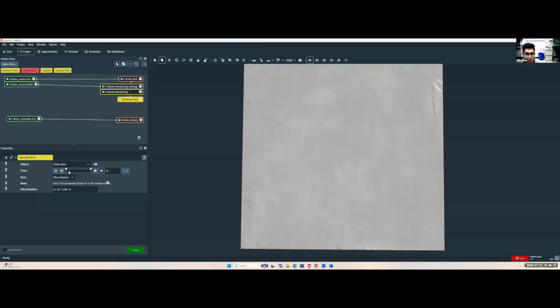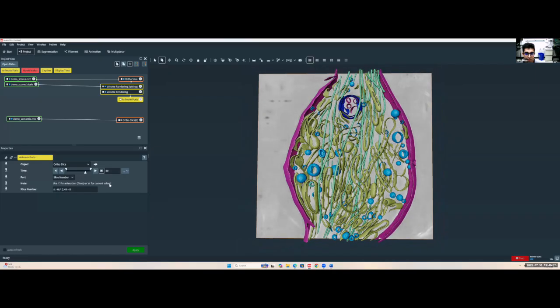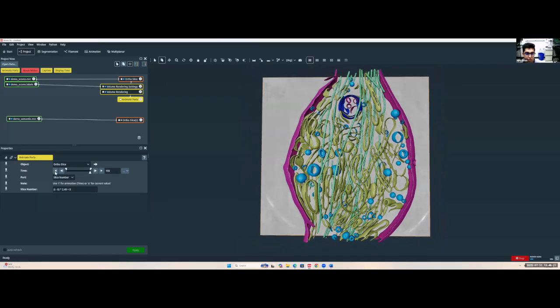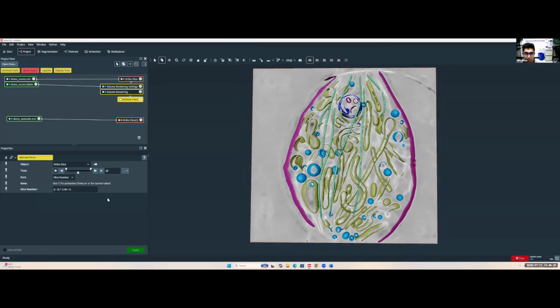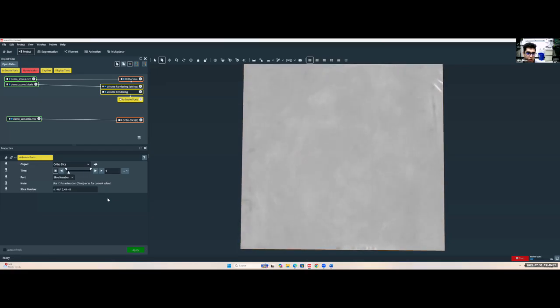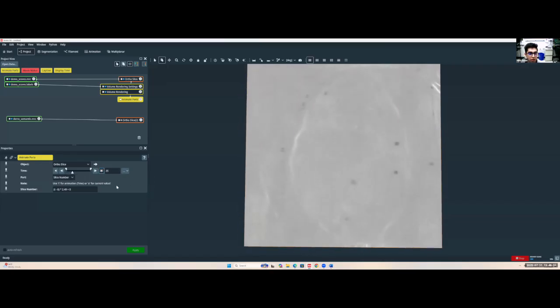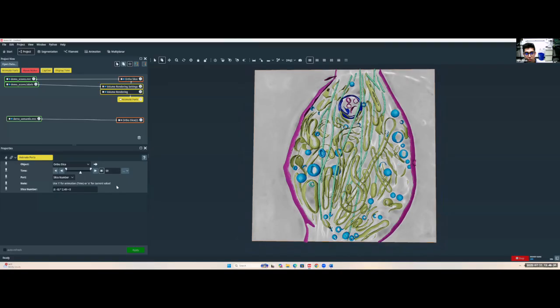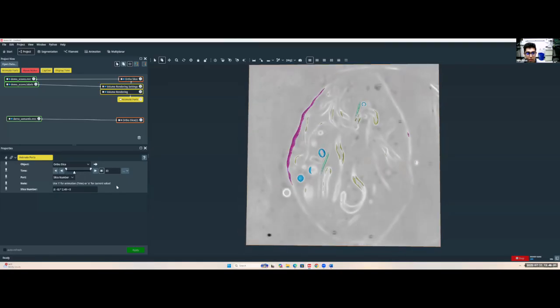I hit play, it'll automatically run through the entire thing. If you hit this button, it'll actually go in reverse, and it'll play through the whole thing. If you want it to keep going forever, you can hit this drop down and loop it. Now, when I hit play, it'll run through all slices, and once it gets to the bottom, go over again.